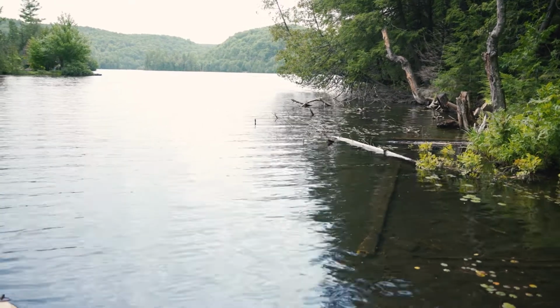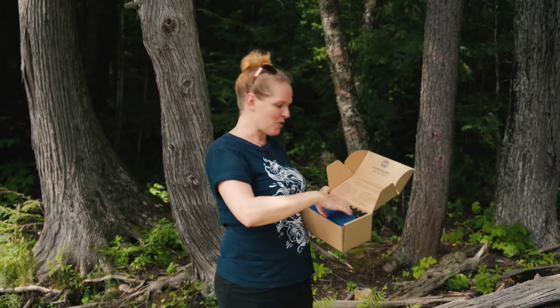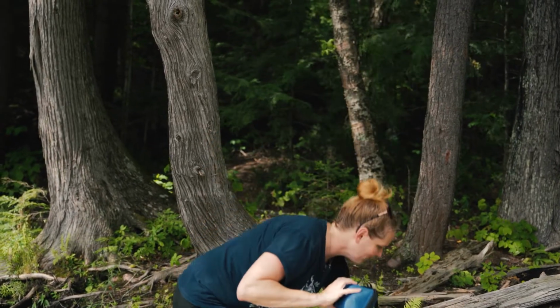So this is a video to explain how to use our Compact Freshwater Test Kit. You'll notice some quick start instructions here on your box, and then there's also some information in your test kit itself on how to do it.